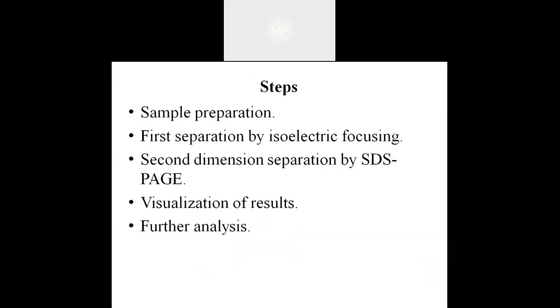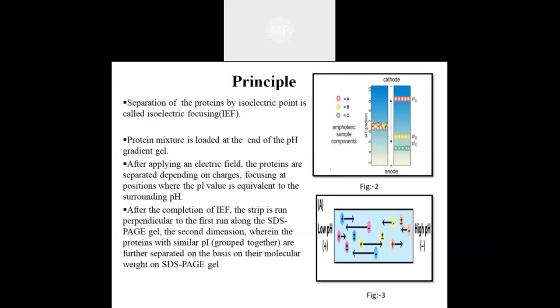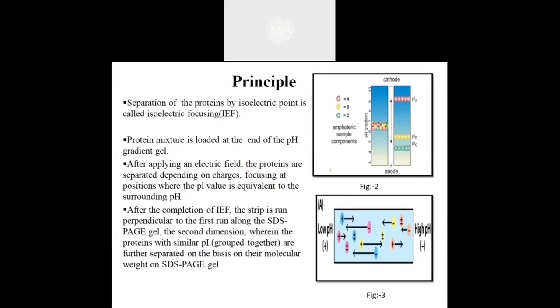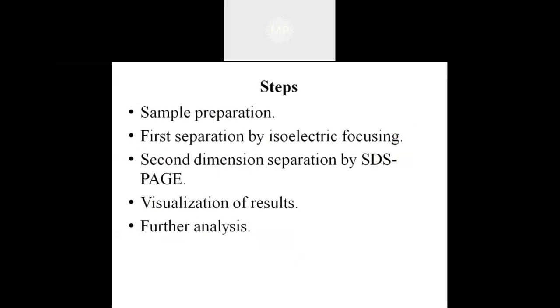And these are the steps. The first step is sample preparation. The next one is the separations. The first separation is done by isoelectric focusing, and the second dimension separation by SDS-PAGE. The next step is the visualization of the results, and the next one is further analysis.